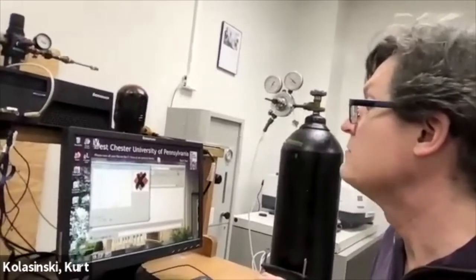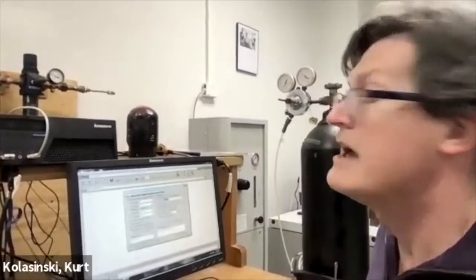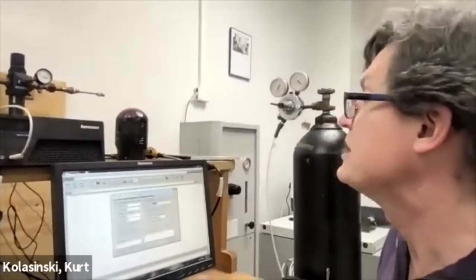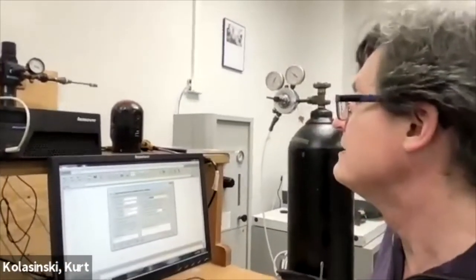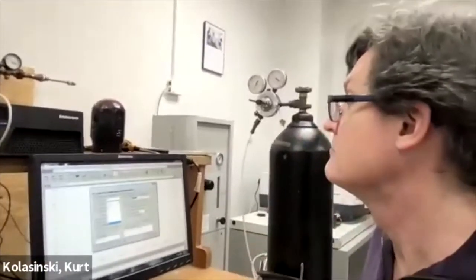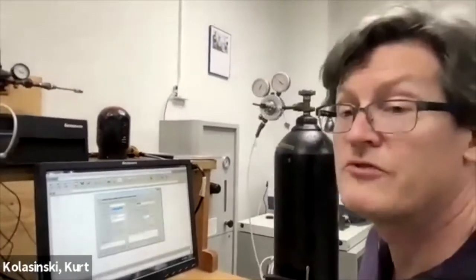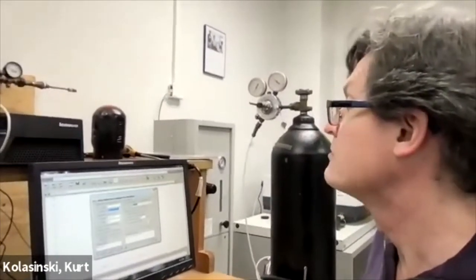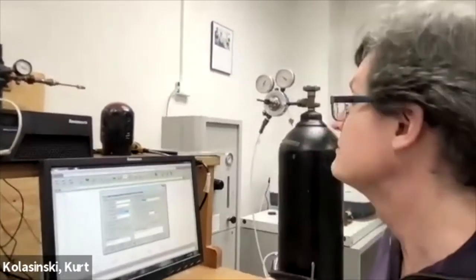And then we want to make sure that we have the right thing up here. We don't. And in the collect screen, that's where we can change the number of scans. I'm just going to make it 4 right now. And the resolution, you can pick a number anywhere from 0.125 to 32. All right, a bigger number is actually worse resolution. So let's just set it to 0.5 for right now, 4 spectra. We're going to take transmission %T rather than absorbance. All right, so I set that there.